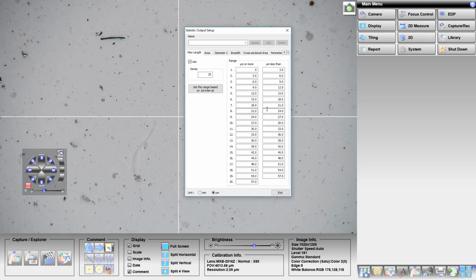And you can also say, okay, after like 15, you can go here to 15 to 20, and then here 20 to 30, 30 to 50, 70, 70 to 100, and then 100 to 150 to 200, and 200 to 300, for example.